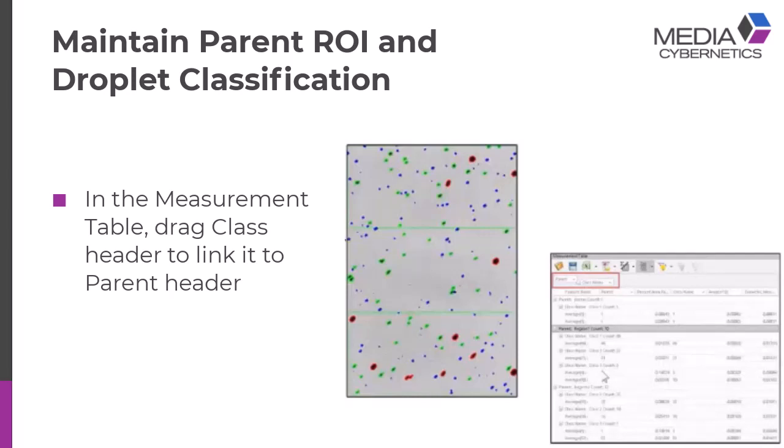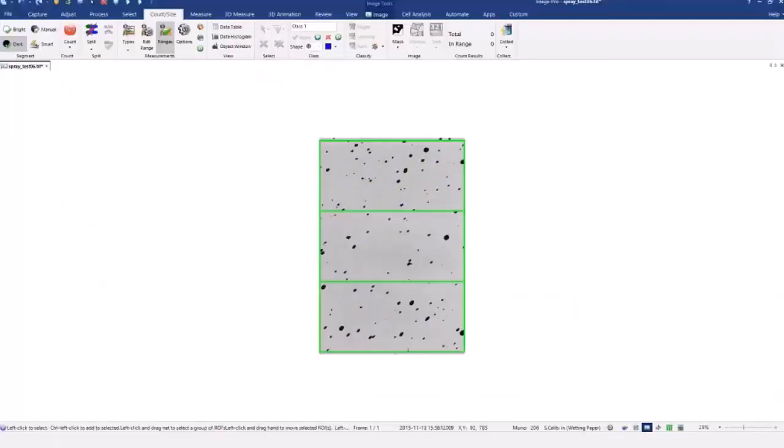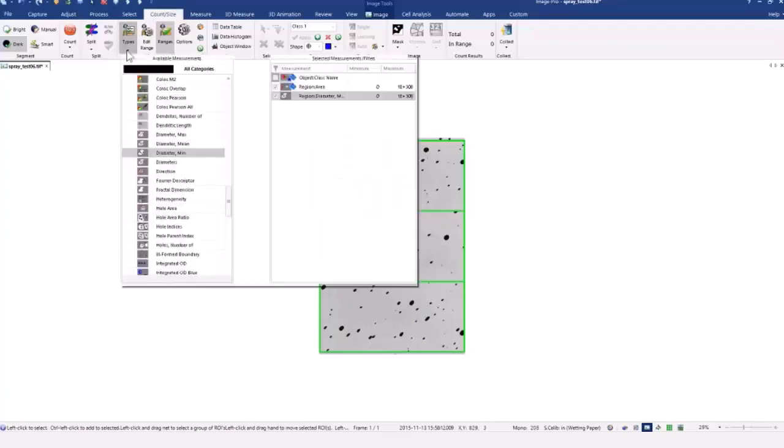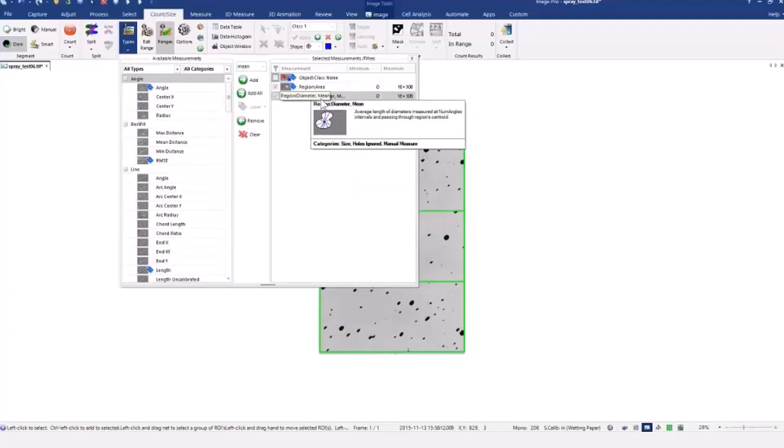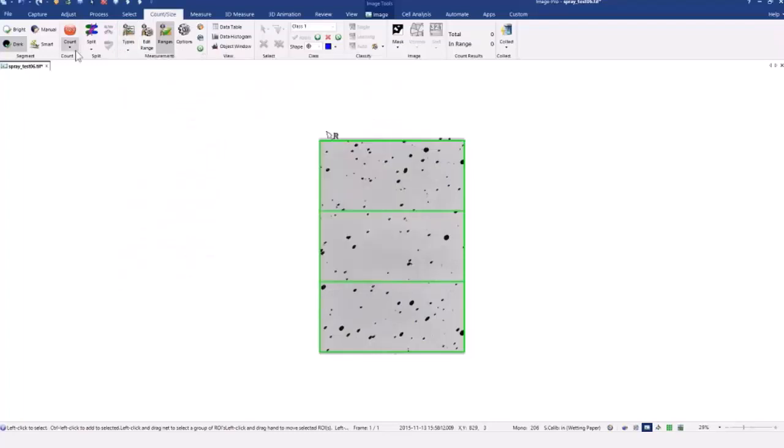So let me just go through a real quick example here. And let me go to ImagePro. So here's my wetting paper, approximately two inches by three inches. I created some ROIs, so I wanted to do a distribution analysis and cover the majority of the paper. Measurement types. I had my object class name, area, and took mean diameter. So I'm just going to do an auto-dark. It's appropriate.